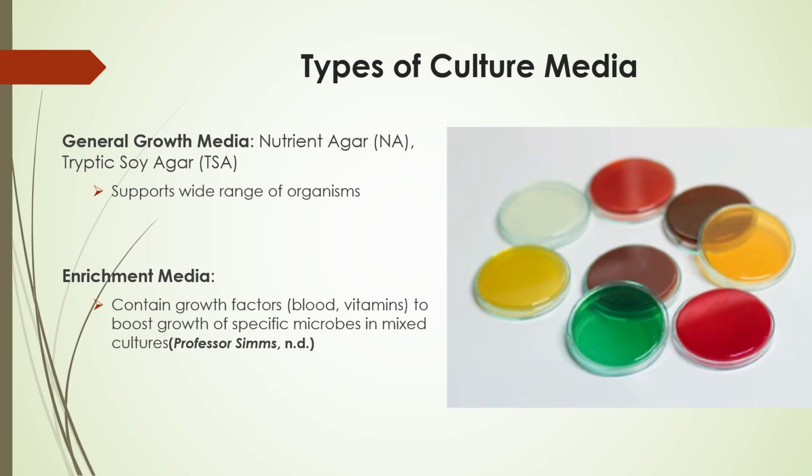Microorganisms are grown using culture media, which differ according to their intended function. Numerous types of bacteria, fungi, and yeast are supported by general growth media such as tryptic soy agar and nutrient agar. These media only offer the fundamental nutrients required for microbial survival and reproduction. They are neither selective nor differential.